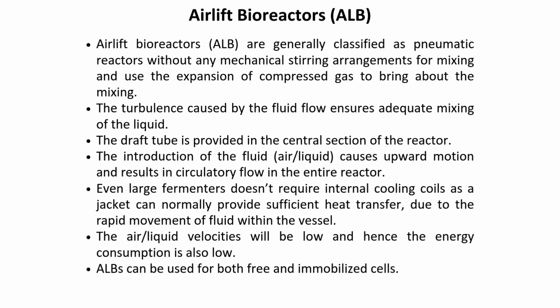As we continue, we find another major type of bioreactor, the airlift bioreactor or ALB. Airlift bioreactors are classified as pneumatic reactors because they have no mechanical stirrers. Instead, they use the expansion of compressed gas to achieve mixing. The turbulence created by the flowing fluid ensures the liquid is mixed adequately. A key feature is the draft tube, which is provided in the central section of the reactor.